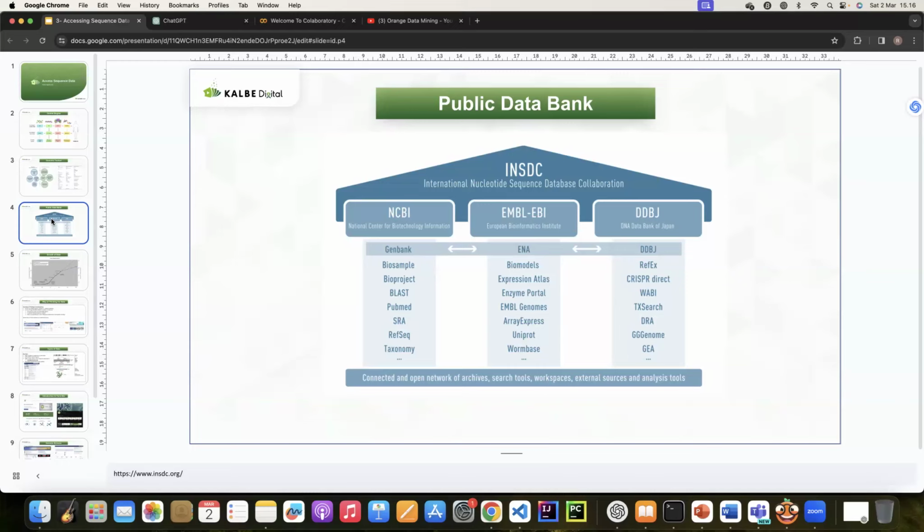And then you start to explore or do analysis. But for you in master degree, I think start with the available data in NCBI or EBI or the DDBJ. Okay, all of this is connected. So as long as you can find the data, let's say COVID data for DNA for COVID or cancer or anything, you can start with public data bank.